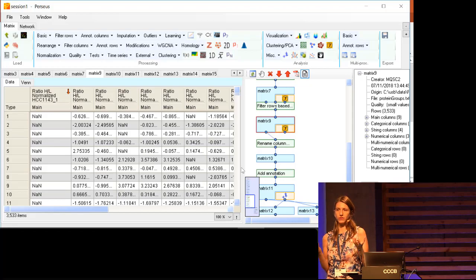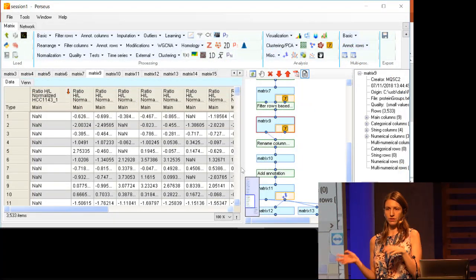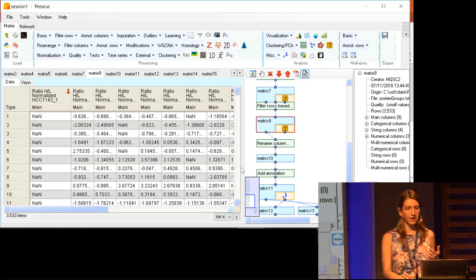You always need to first look at your data, look at those distributions, really check if there's anything strange in there, find outliers, and also apply any normalization if it is really necessary, because if you don't set the stage in the right way, then all the analyses that you do afterwards may actually lead you to the wrong conclusion. So this is really the heavy lifting that you did till this moment. So now there will be a lot of fun things to come.